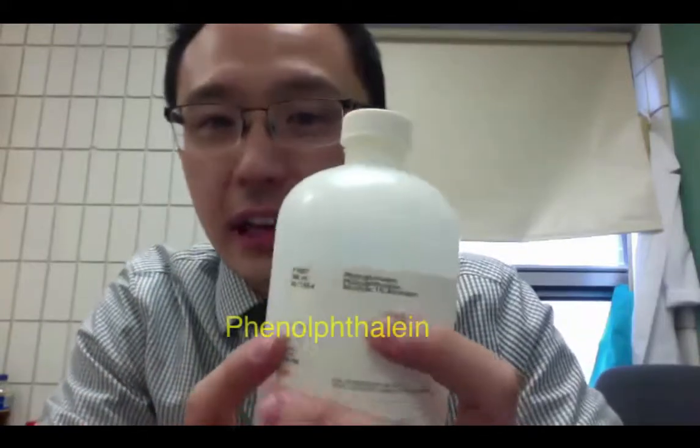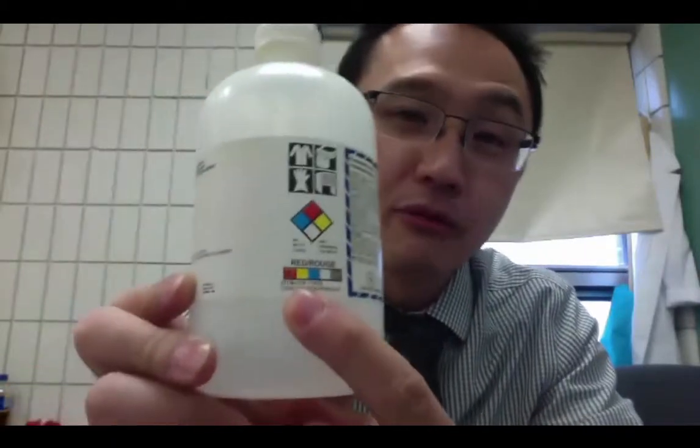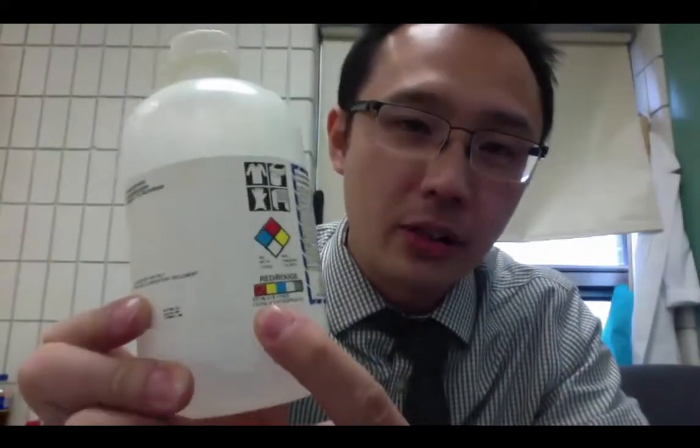this has a really complicated spelling. It's your phenolphthalein. And you can see this one, you have to be kind of careful in how you store it because it is very flammable. So use caution when you're using this.